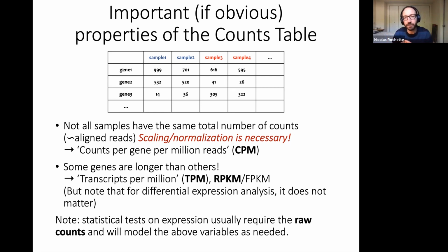But it is usually very, very close, like within a percent or 2, to just dividing by the total number of reads. Essentially it's just trying to avoid giving highly expressed outliers too much weight in the normalization factor.